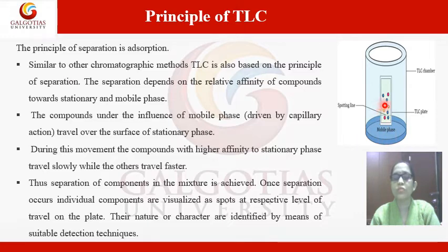Non-polar compounds will be separated fast. If we take medium polar compounds, the non-polar compound will be separated, but the polar compounds will rise from the spotting but will not move so far. So on the TLC plates, the compounds will be separated on the basis of polarity. That means polar compounds will move slowly and non-polar compounds will move fast.